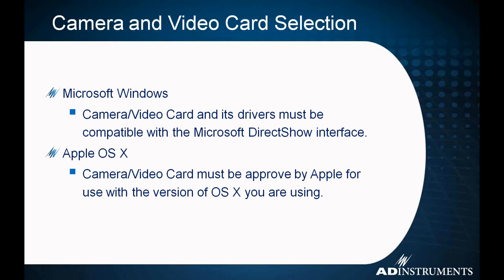For Microsoft Windows, the big thing to look for, and the standard we use, is the Microsoft DirectShow protocol, the interface for bringing in streaming video. So your camera or your video card, either or, that can be identified by video capture has to be Microsoft DirectShow compatible. Other word of warning here, make sure you're buying from a reputable company. Quite often people will buy things from gray market Chinese companies, and they don't always have the best software development, so the drivers for the camera may not work right. They claim they're DirectShow compatible, but their drivers aren't written very well and will have problems in bringing the video stream into LabChart.